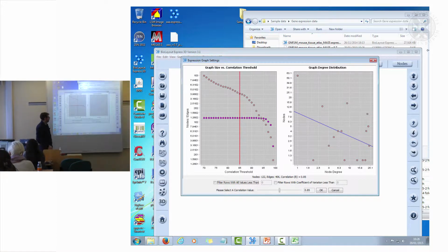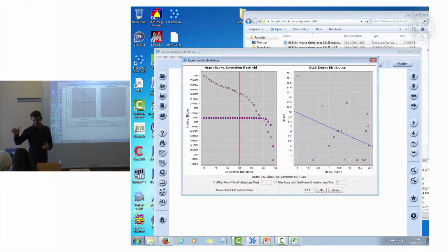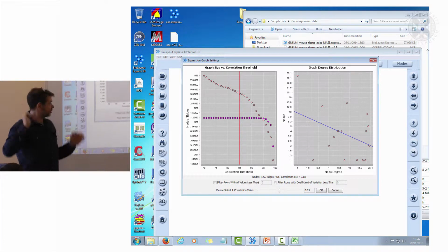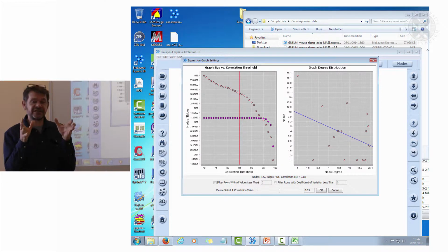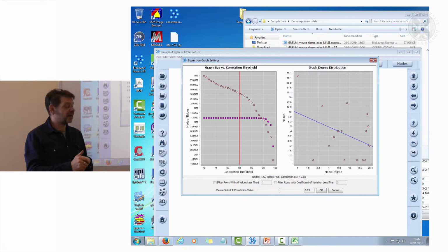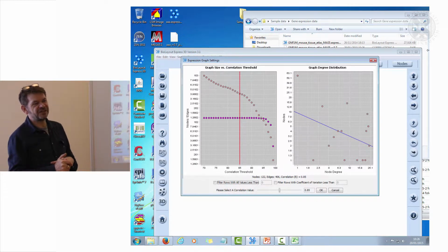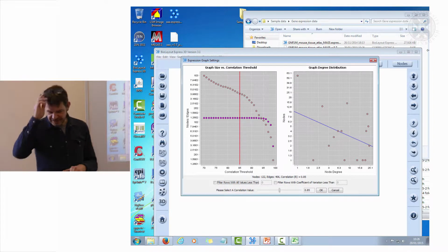So when you load data in, you probably saw a quick calculation there. The GNF dataset is the dataset which we developed this for originally, because it was the one I could least understand. This is a dataset of 61 mouse tissues, which was published, I think, in 2004, and it was the first expression atlas. It tried to define the entire transcriptome of the mouse, and it's still a nice data set.